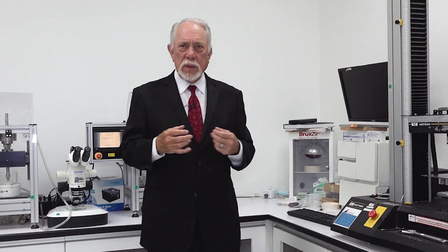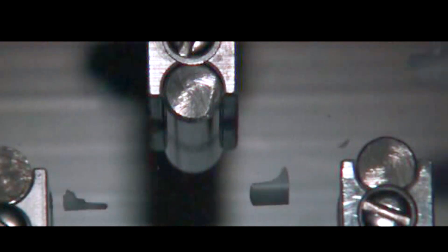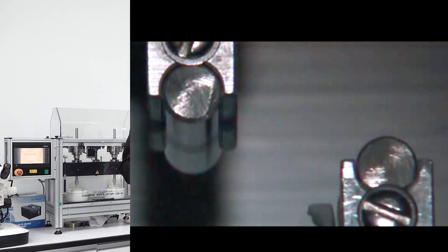I'm standing right now in front of part of the research and development operation, and just some simple tools that we use here over the years. One of them would be this Instron machine — it's a three-point bending test. A hydraulic ram comes down and breaks it, and then we get a readout as to exactly how many megapascals of strength it exhibited. We've tested a lot of feldspathic porcelains in here.